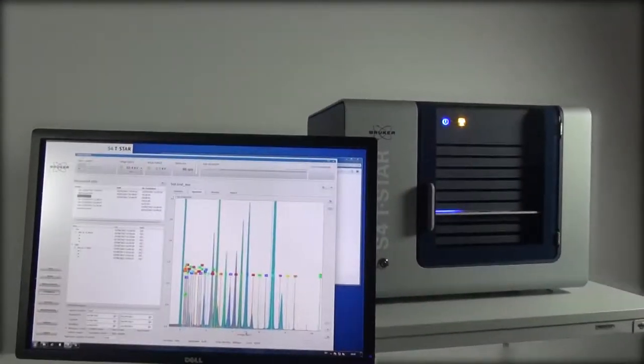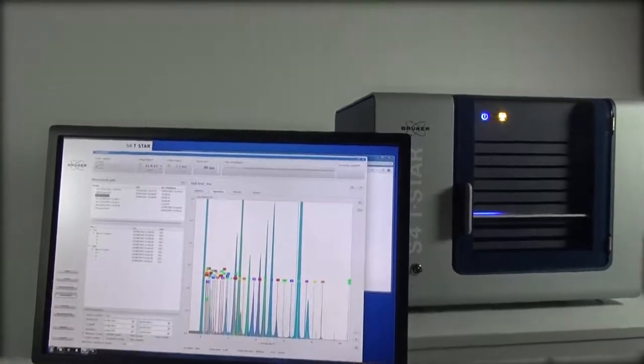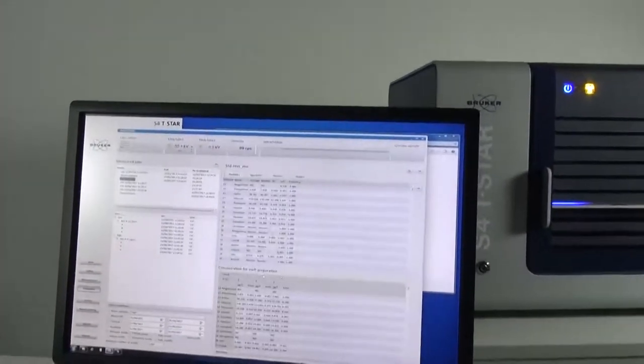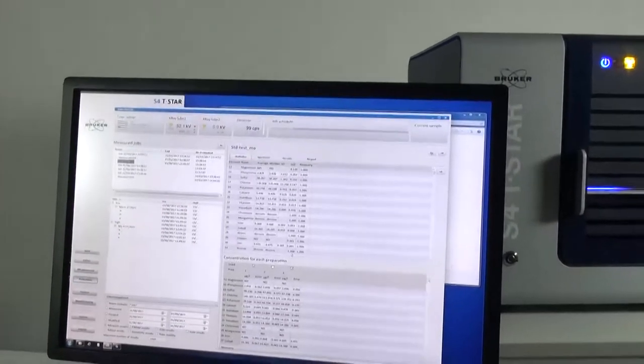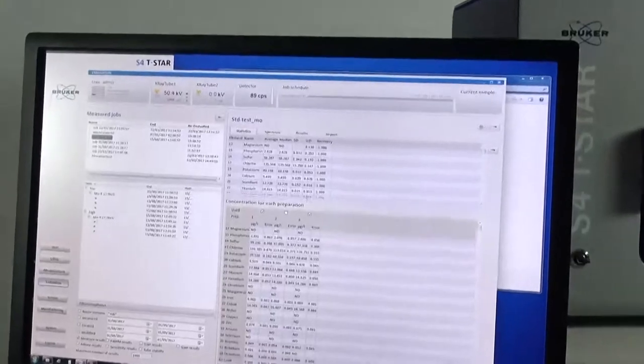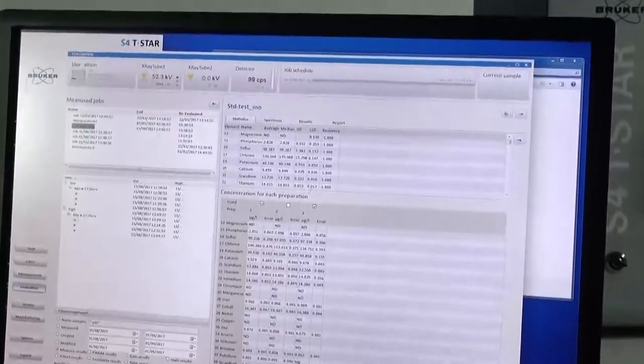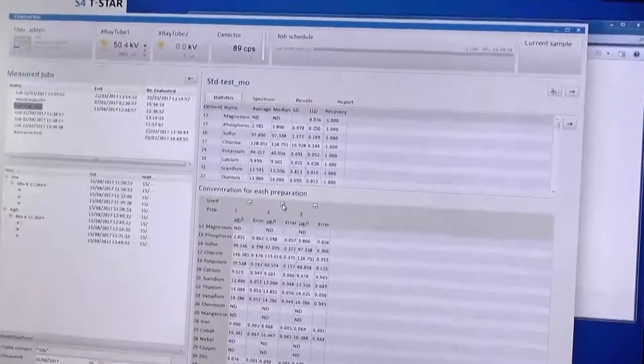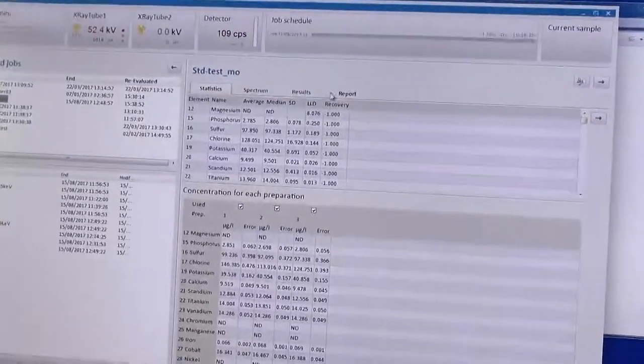The user-friendly software helps to set up your measurement task quickly. Right after the measurements, quantitative data including statistical calculations and reports are created automatically.